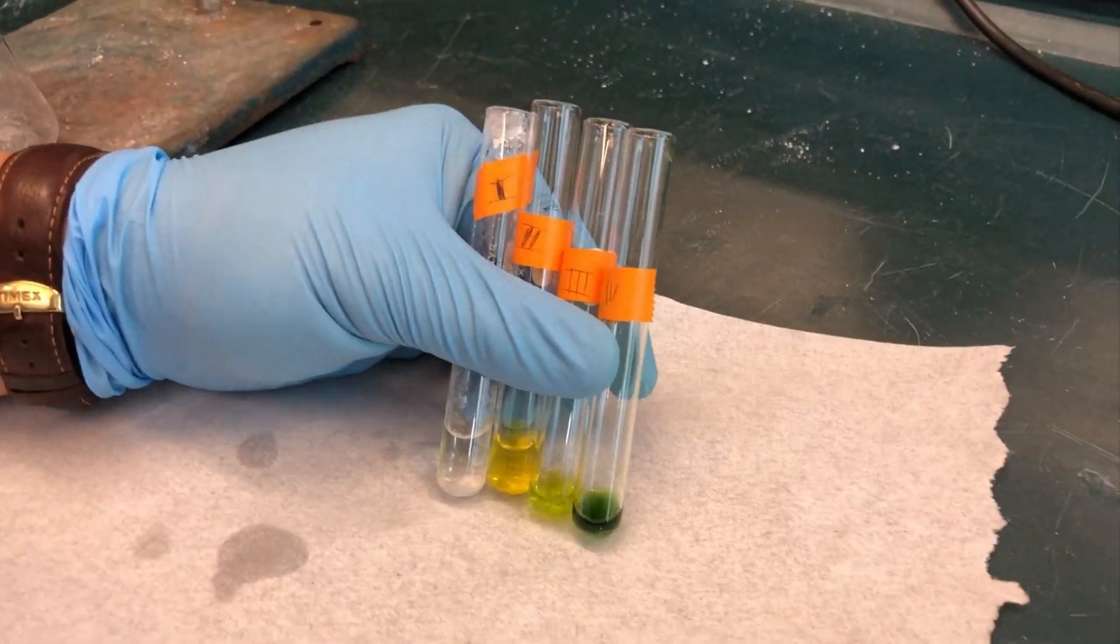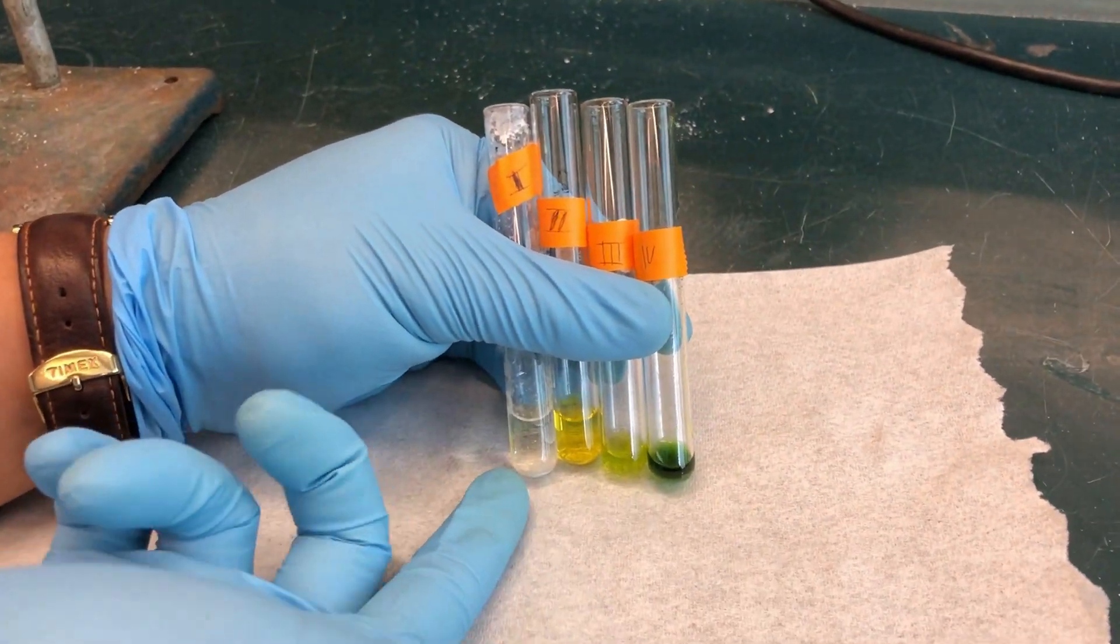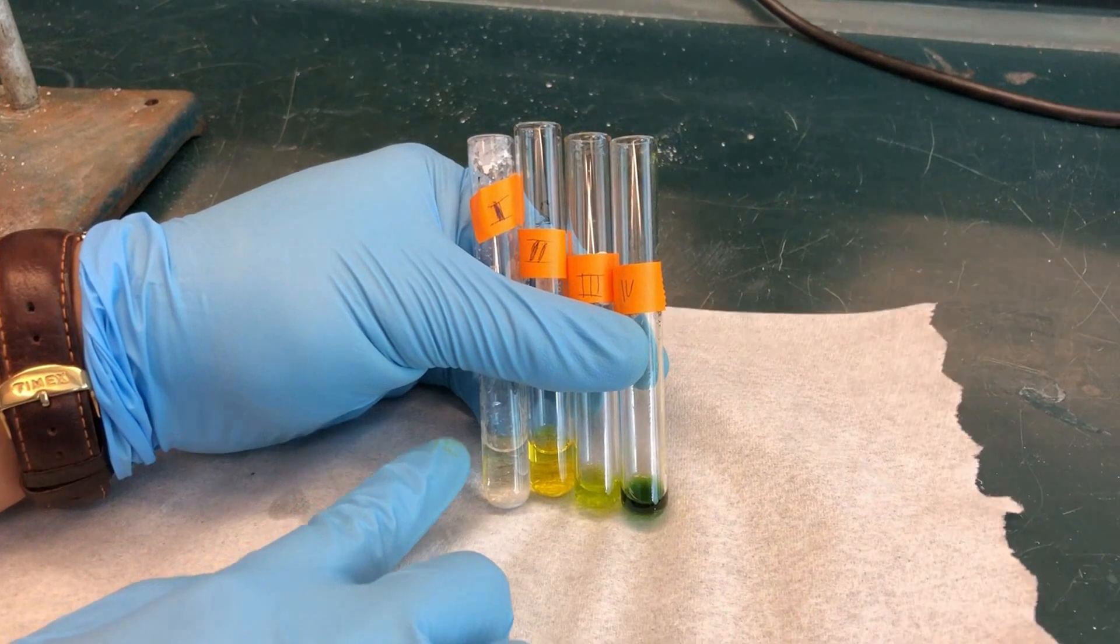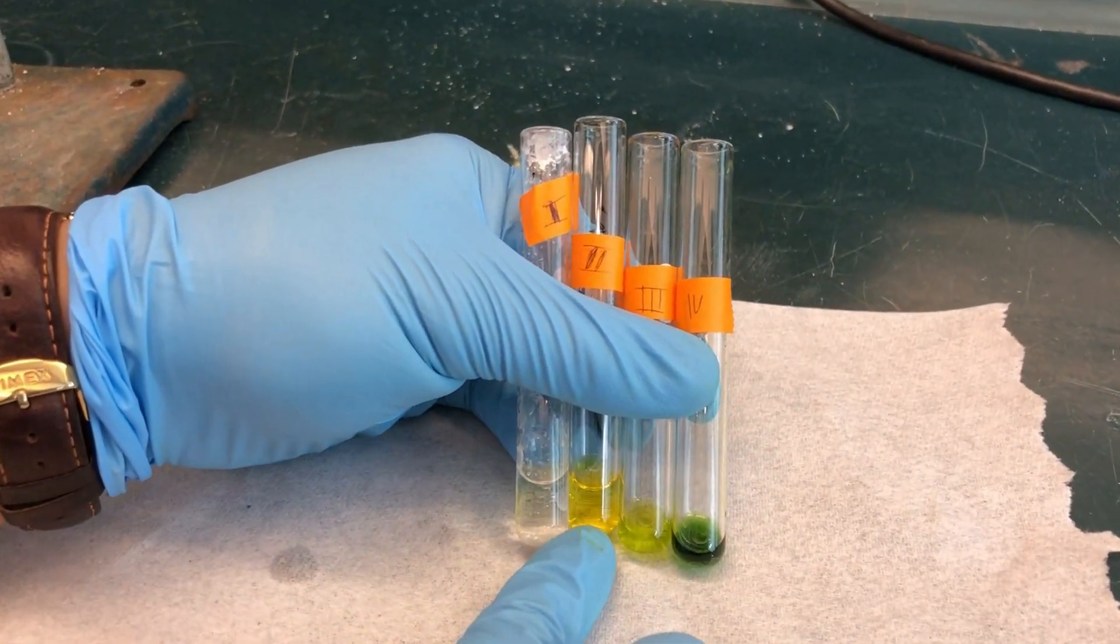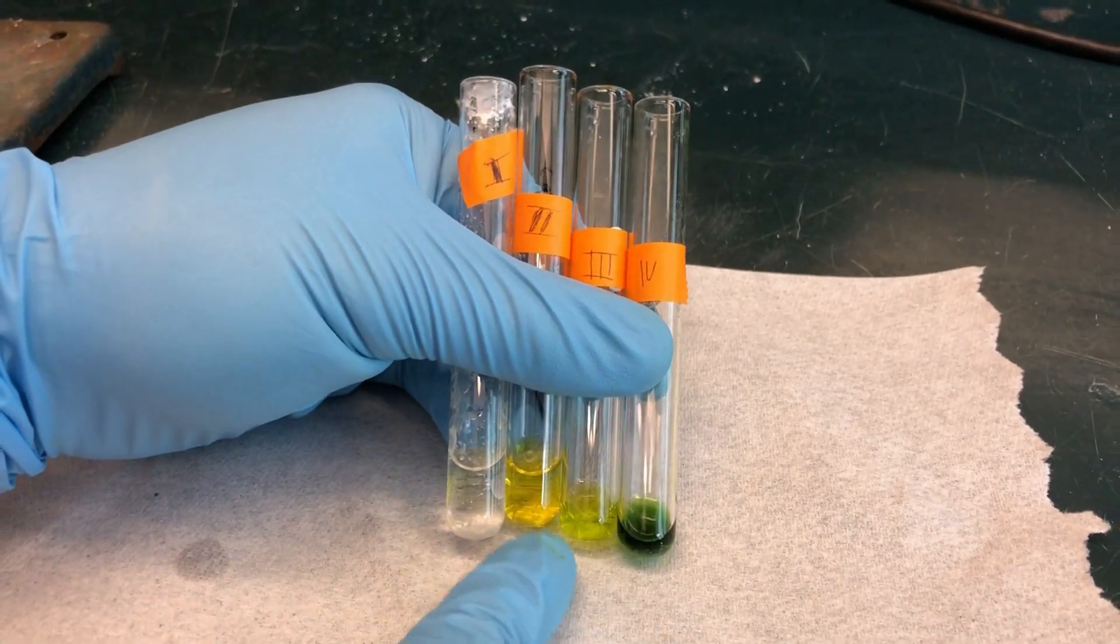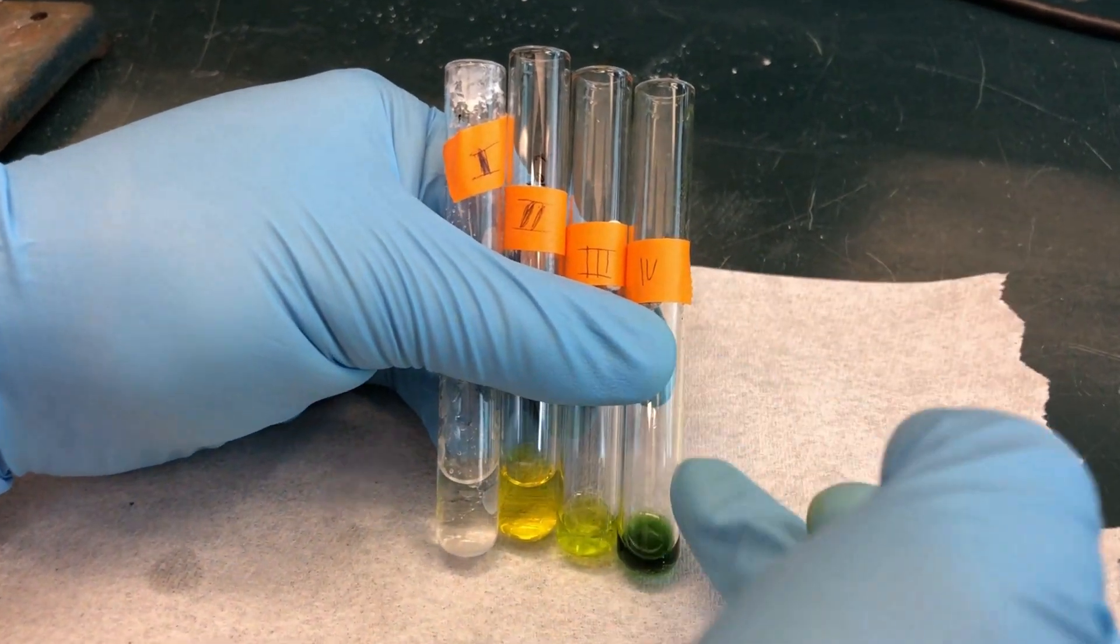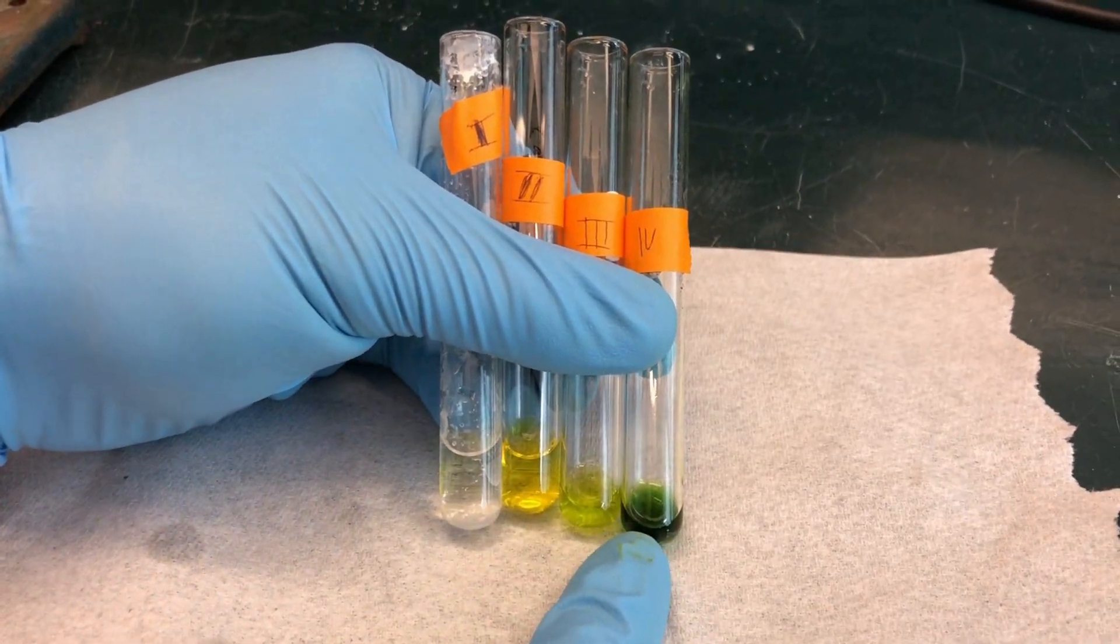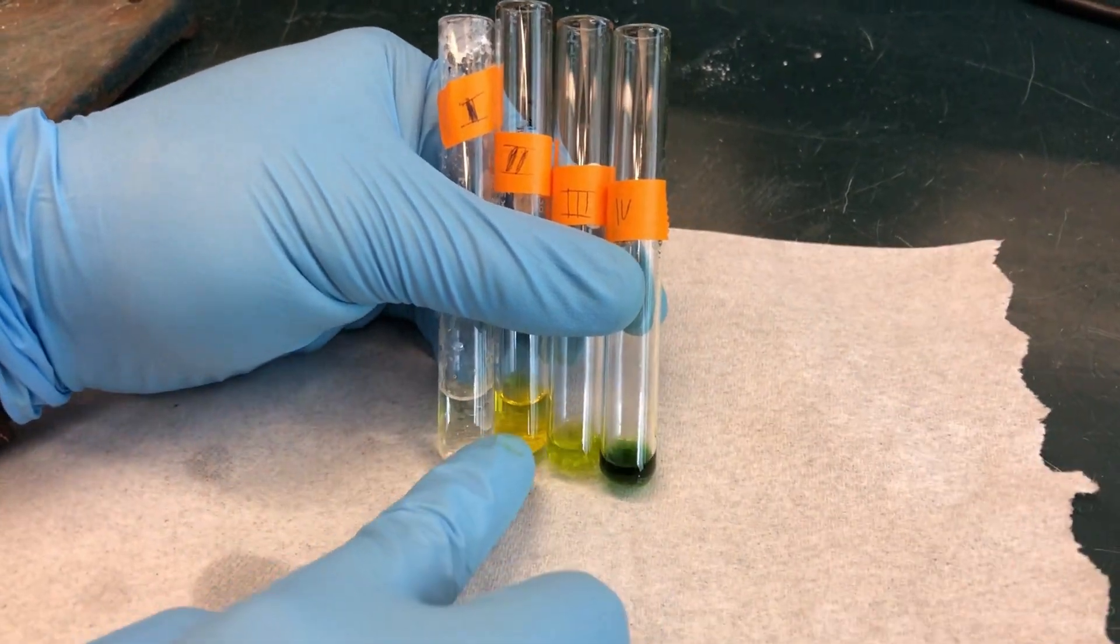Here you can see our four fractions. Test tube 1 has the petroleum ether, which is colorless. Test tube 2 has our yellow pigment. The intermediate is test tube 3. You can see it is between the yellow and the green color. And test tube 4 showing the green pigment. Test tube 2 and 4 would be used in the following TLC lab, which is not covered in this video.